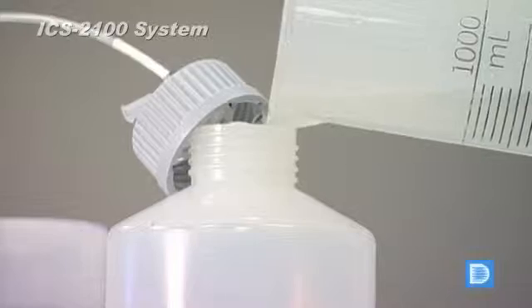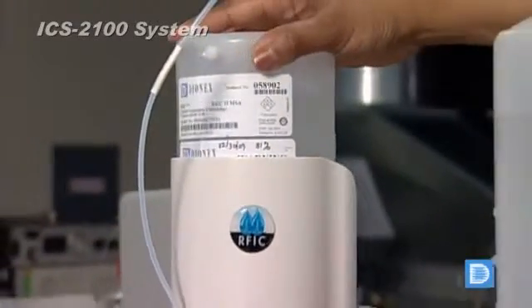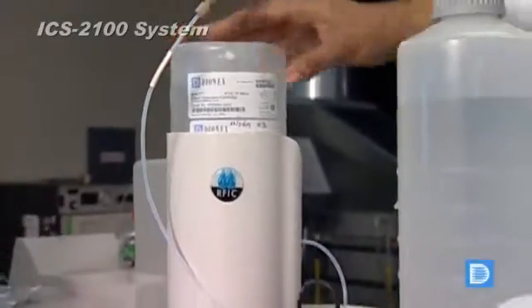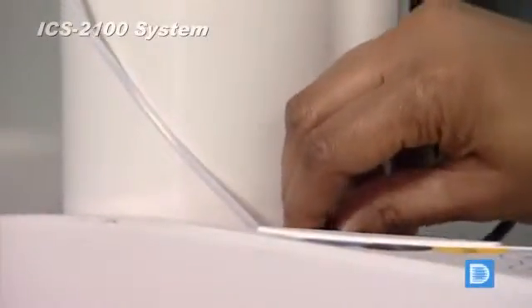Just add water to the system and you're ready to go. Alliant generation eliminates the need to manually prepare alliants, which require less expense, time and labor. Alliant preparation errors are eliminated.